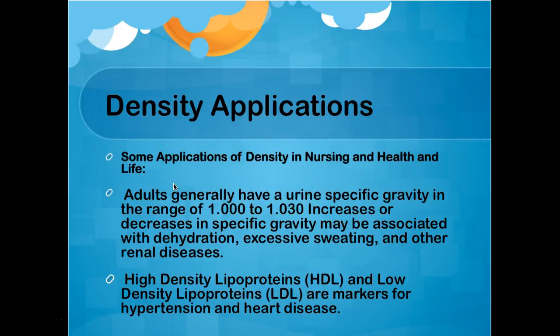As far as aim, your aim is to measure the densities of water, ethanol, aluminum, iron, and then use density to identify your unknown metal.